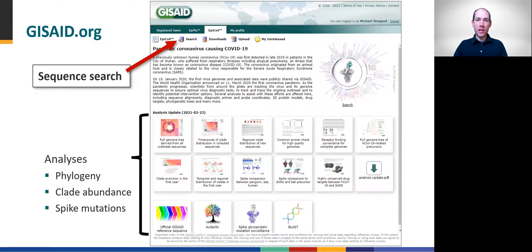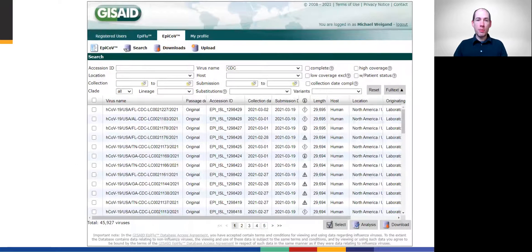This screenshot of the GISAID website shows an overview of what's included within the EpiCoV database. This module will look briefly at the search function, accessible at the top, but know that GISAID regularly performs several analyses and provides some summary reports of the database. The EpiCoV database is huge — on the day this module was recorded, nearly 900,000 entries had been submitted from around the globe.